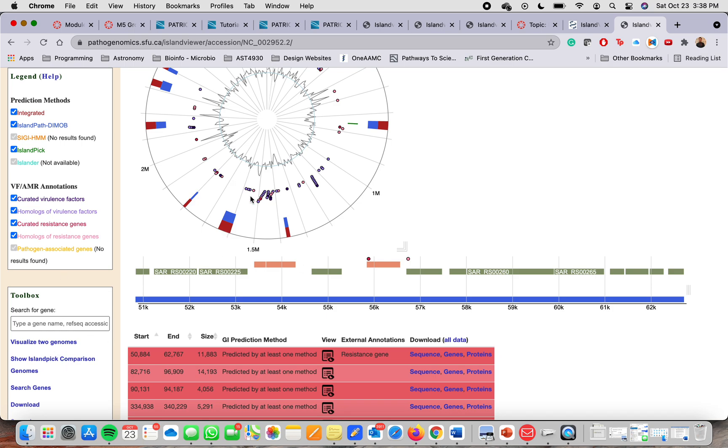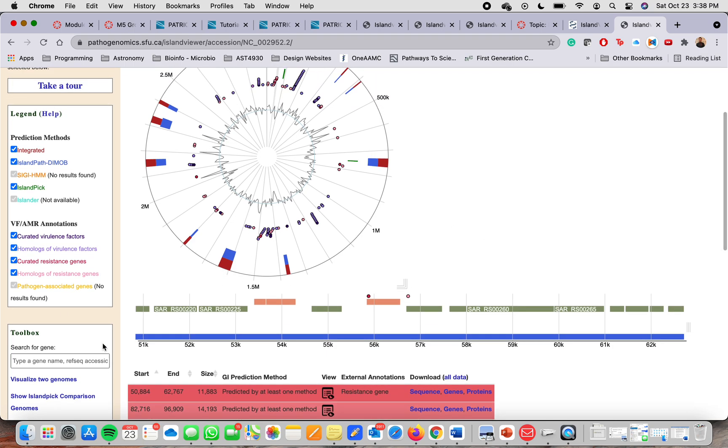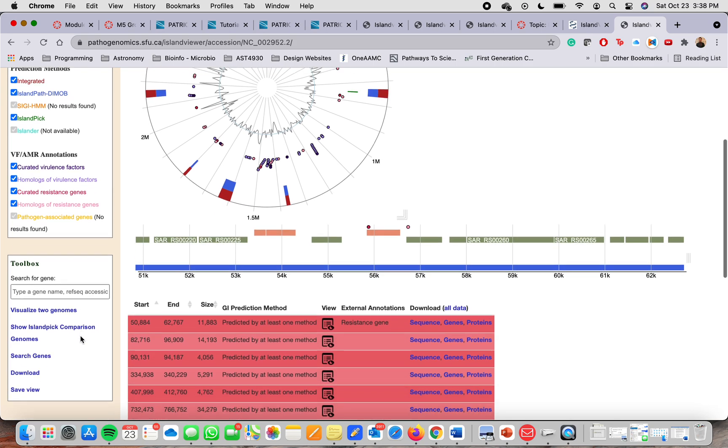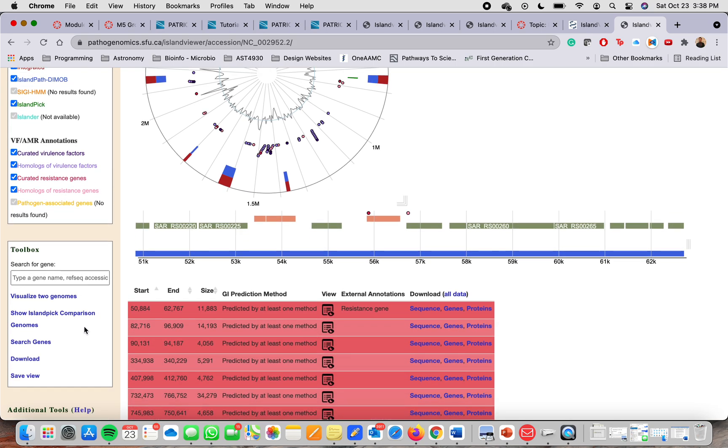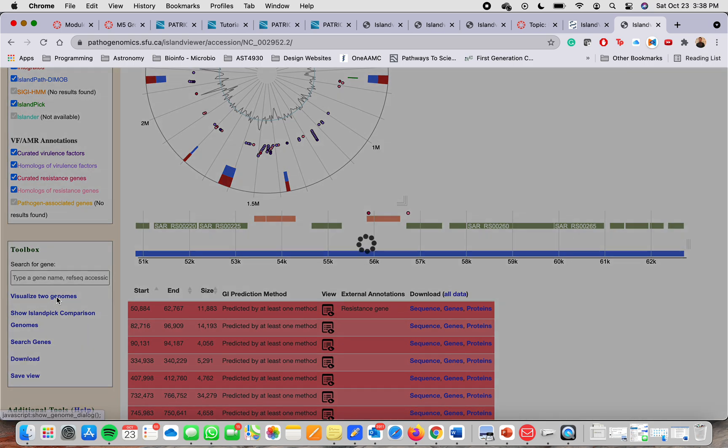If you want to compare or visualize two genomes, you go on the left side of the window and you can see this tool box. Here, you're going to click on visualize two genomes.